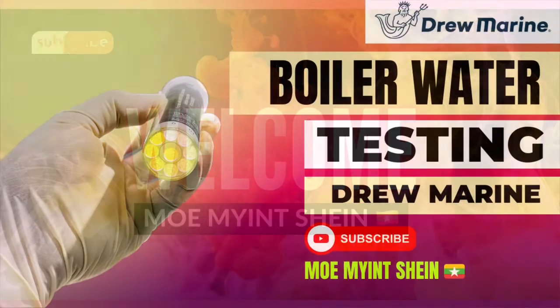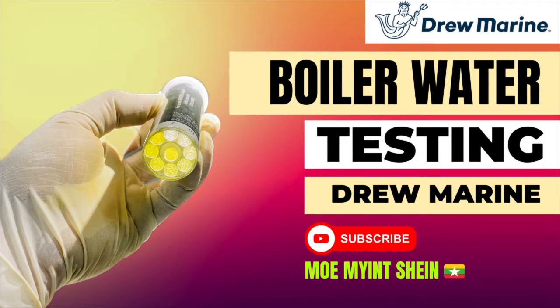Hi, nice to meet you again. In this video, you can see how to carry out boiler water and cooling water tests by using Drew Marine products.